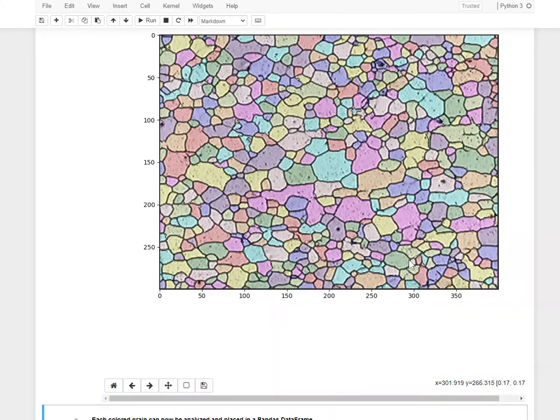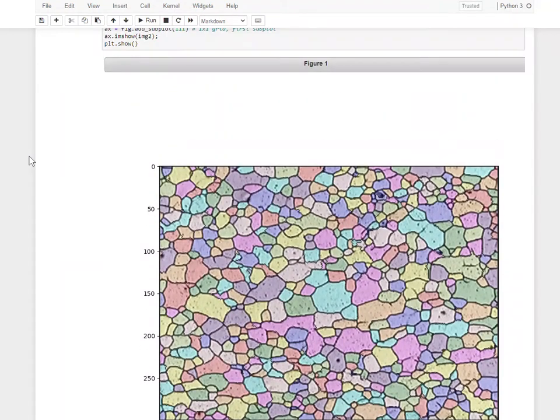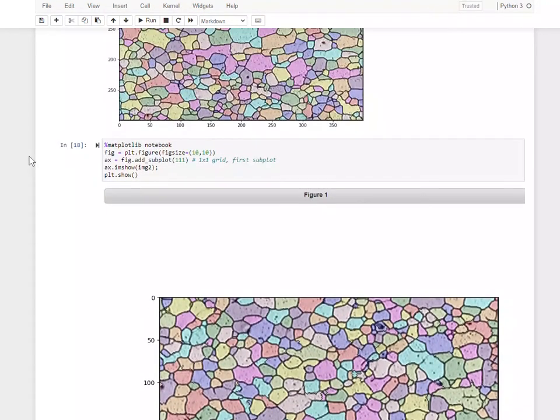So if I had a bar down here, all I'd have to do is come over and read off the X value for that position, read off the X value for the end of the bar, and just subtract them. And that'd be how many pixels across for the micron bar. So that's all you have to do for that. For the homework, I do have some images for you that have micron bars in them, and so that's what you do.